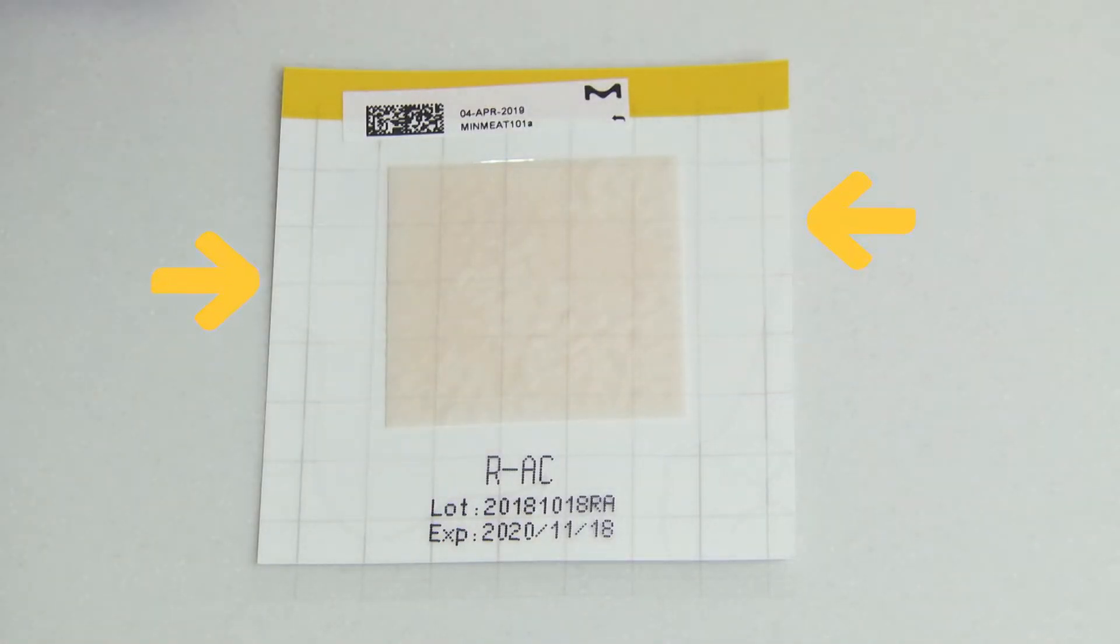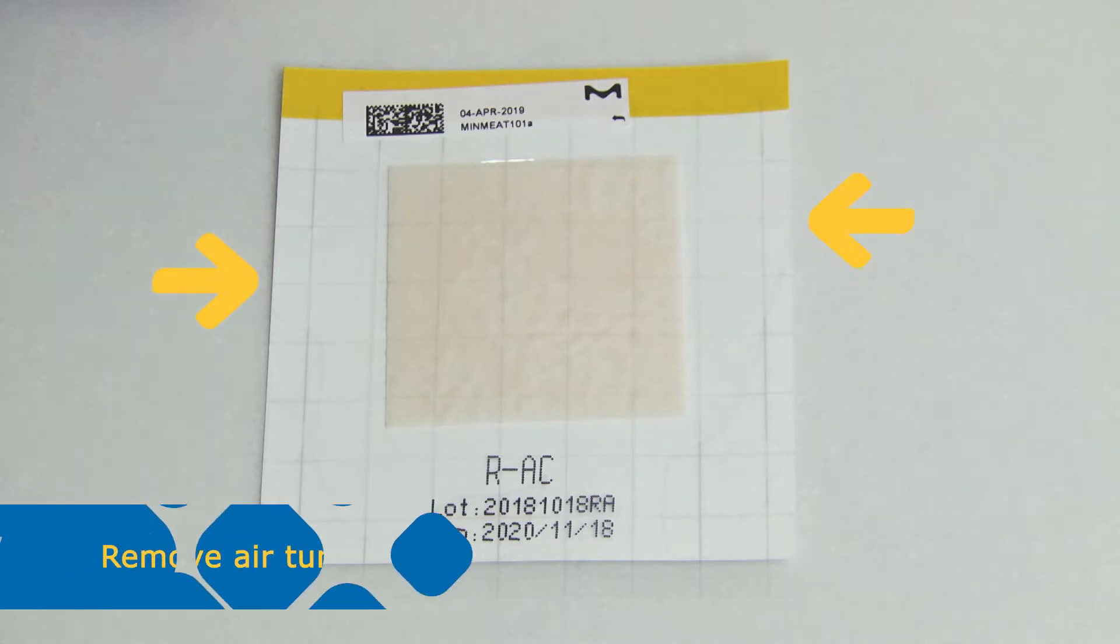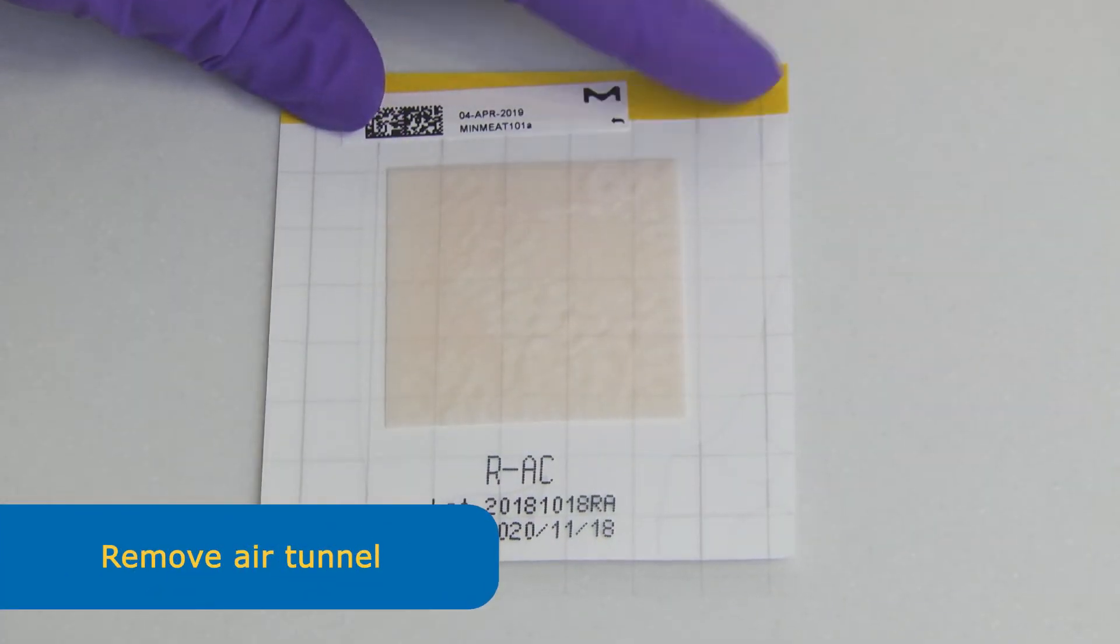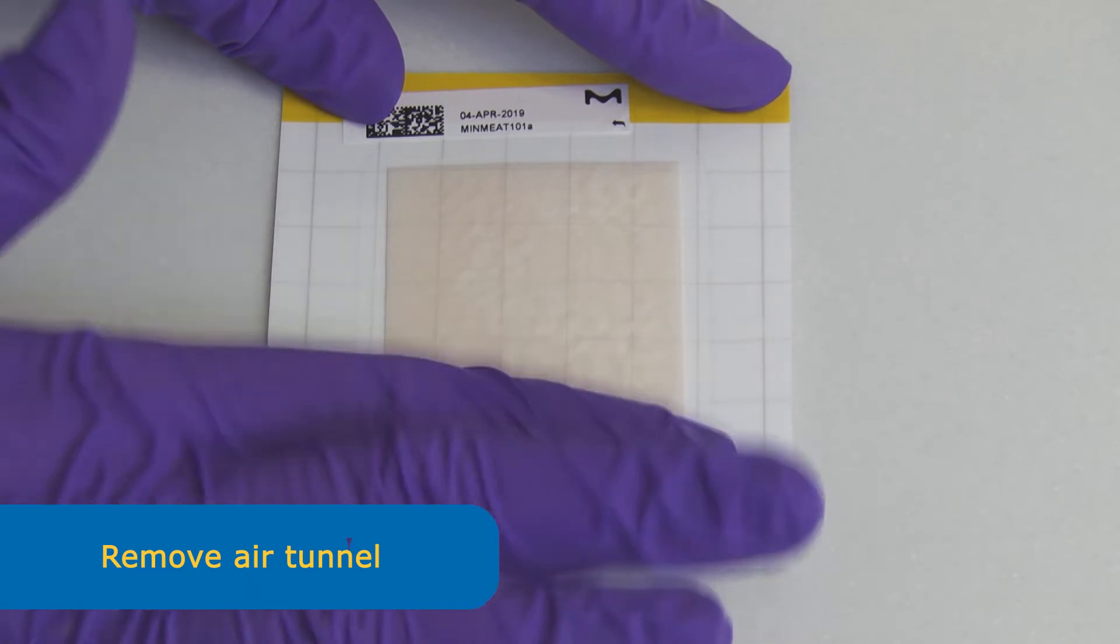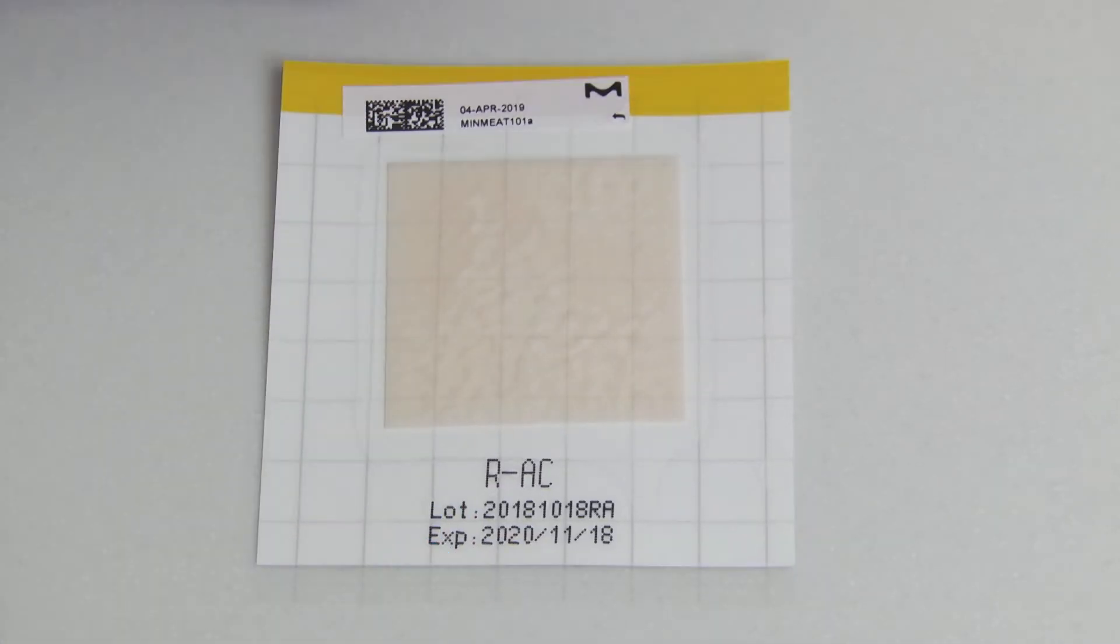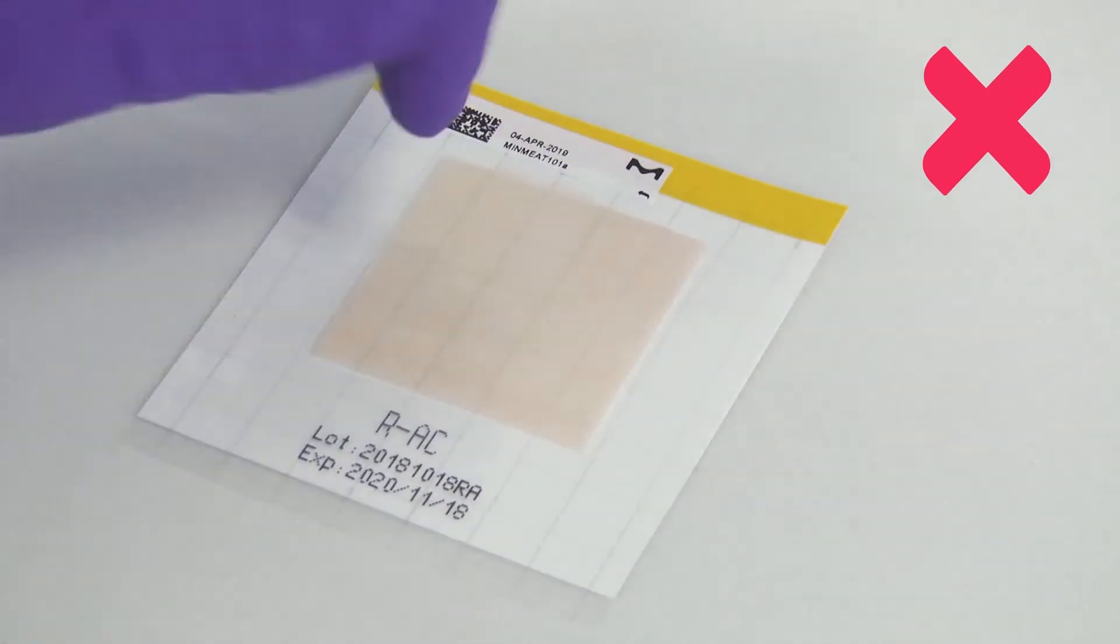Check the closed pad for any air pockets that reach to the end of the pad. They could allow air to enter and lead to the pad drying out. Do not apply pressure on the pad to close it or to remove air tunnels.